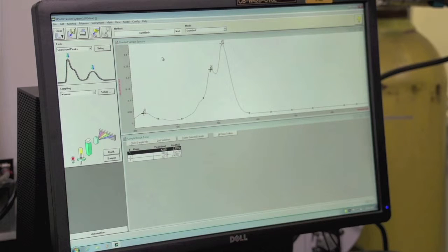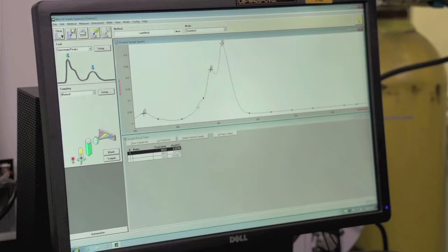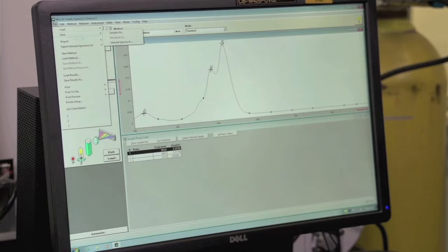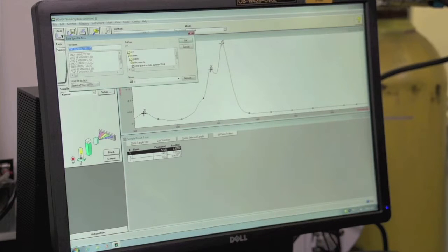Now that we've collected our spectrum, you'll want to save the spectrum. Click it to make sure it's highlighted. It'll have these diamonds to know that it's highlighted. Then save it by going to file, save, save sample as, and then give it a title that is your name and the date and the sample. You'll want to save it in the public folder for this one, so it'll be in the C drive and then users, public, public documents, and then a folder that has your name and the date.